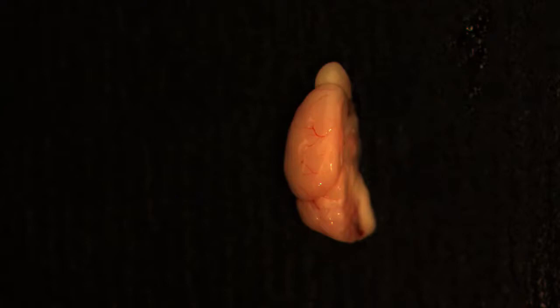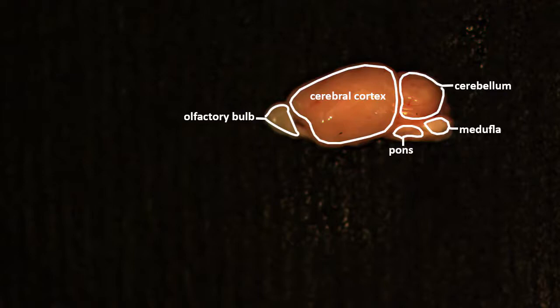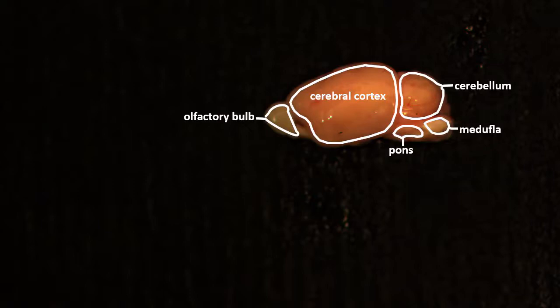Place the half brain with its lateral side facing up. Since this is fresh tissue, you can easily distinguish the different parts of the brain as they differ in colour. Using the scalpel blade, cut off the posterior parts of the brain, the midbrain and the hindbrain, by cutting along the border of the cerebral cortex. Then cut off the olfactory bulb.